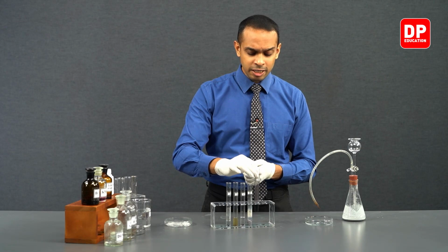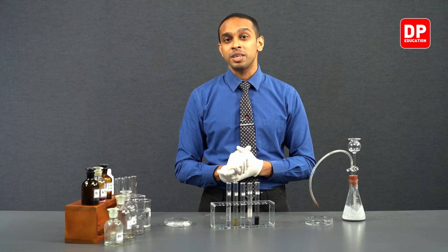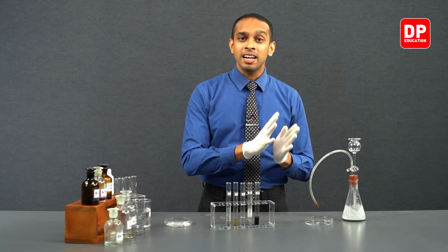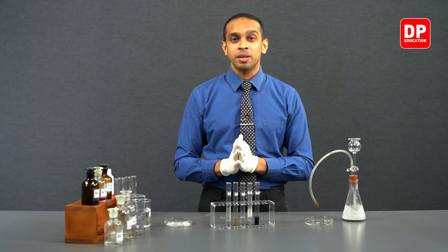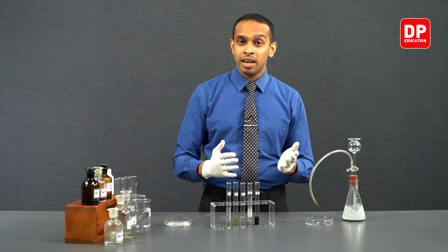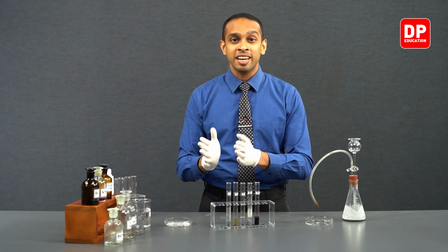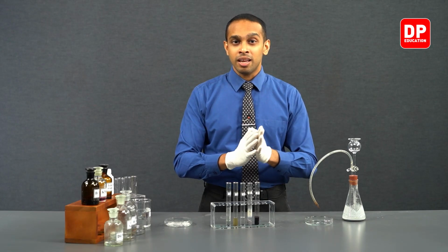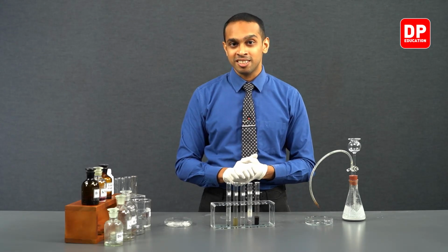So this brings us to an end in this experiment number 24. I hope you have observed how alkenes and alkynes react differently with different chemical reagents such as bromine water, acidified and alkaline potassium permanganate, and then we have ammoniacal silver nitrate and ammoniacal cuprous chloride. So we observed how ethene and ethine reacted with all 5 of these reagents.